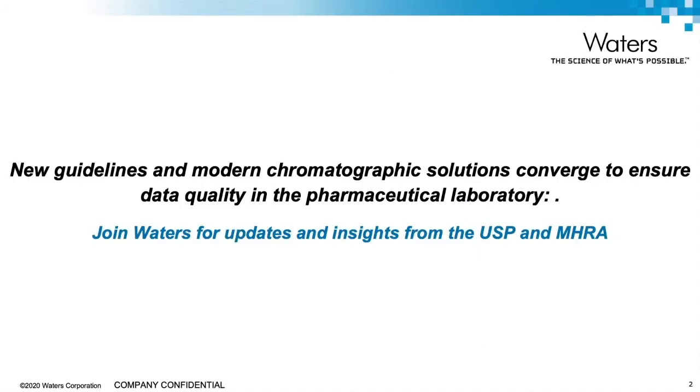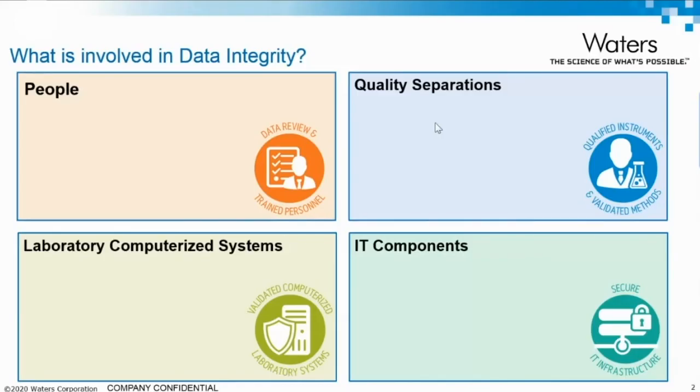Thank you, Sarah. So today I'm going to give a quick summary of an earlier webinar that I gave on behalf of Waters, just to introduce the topic. And during that seminar, we did raise some questions, and hopefully today we're going to answer some of those questions for our audience. When I talk about data integrity, I do like to use this slide to talk about the people, the laboratory systems, the IT components, and the quality separations. But today, what we're really going to talk about much more is around the quality separations aspect of it.